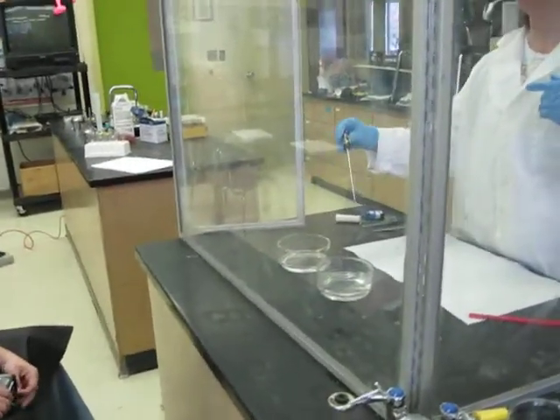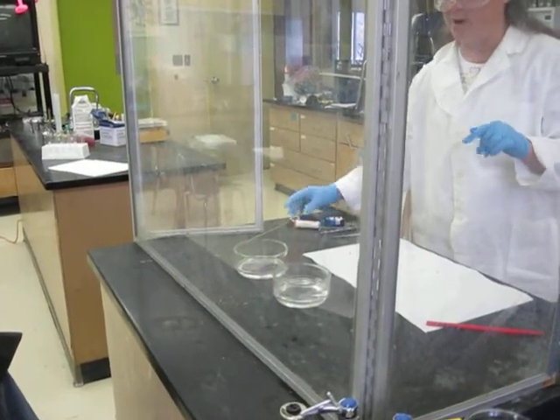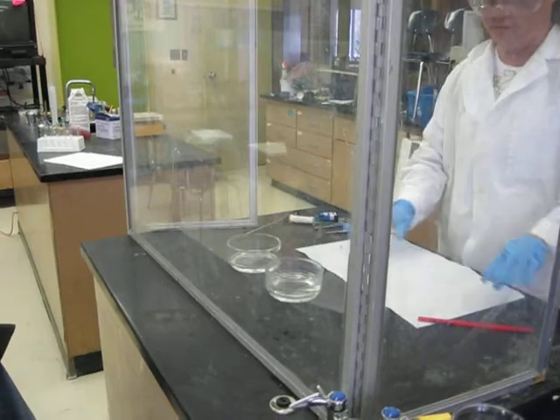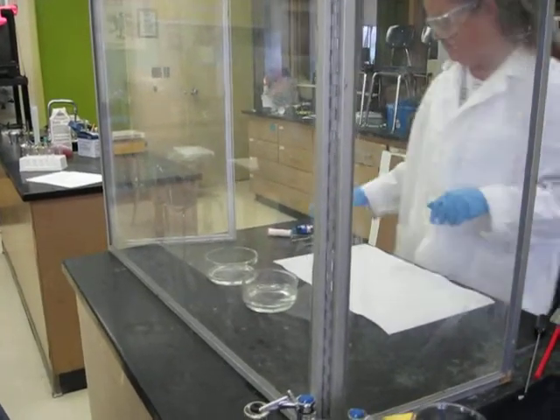Okay, the water is 32.3 degrees Celsius. So prior to the reaction, the water is 32.3 degrees Celsius. Record that on your page.